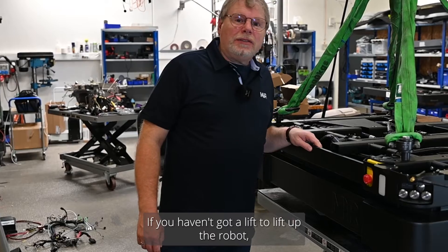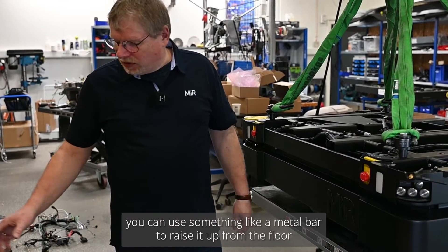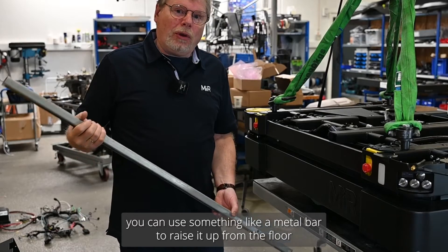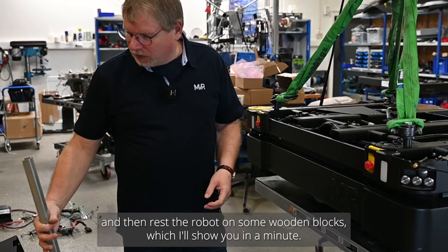If you haven't got a lift to lift up the robot, you may get away with just using something like a metal bar to brace it up from the floor and then rest it on some wooden blocks, which I'll show you in a minute.